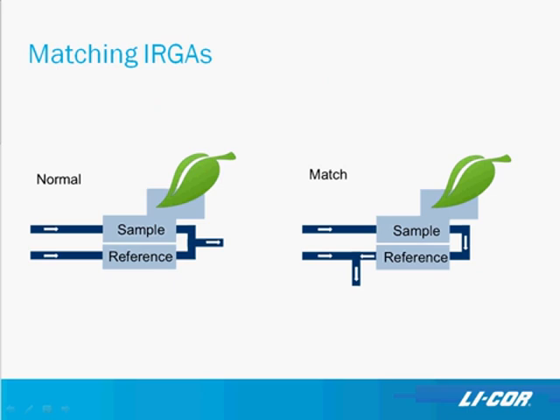The other thing I'll mention is the importance of matching. Matching flows the same air through the sample and the reference analyzers, which helps us detect and then correct any analyzer drift in the sample cells. This could be caused by changing CO2 concentration, changing temperature, changing flow, dirt, pollen, really anything that makes the analyzers sort of wander off from each other. We designed our instrument to take the analyzer drift into account, so it's very important that you match and make sure that there isn't any.